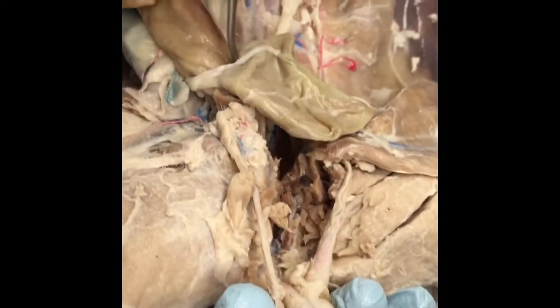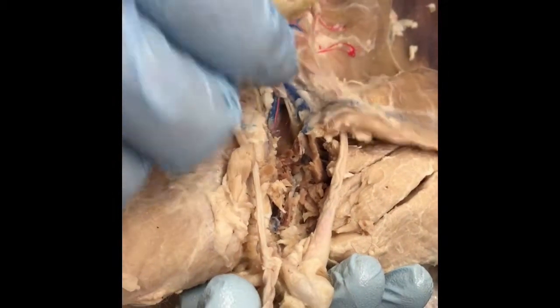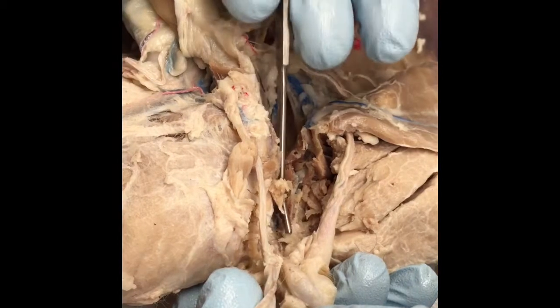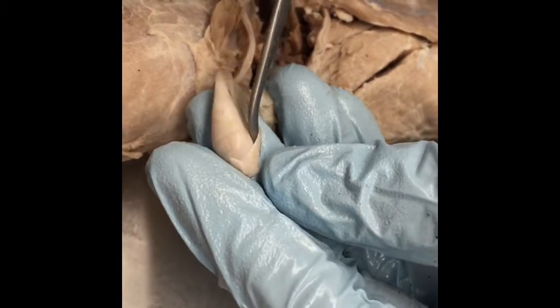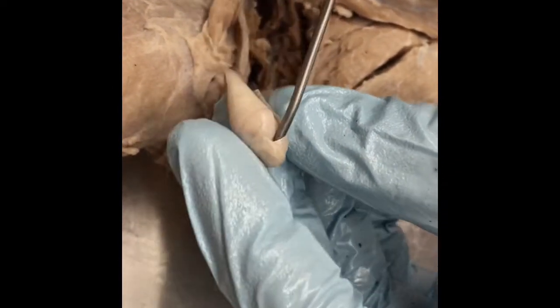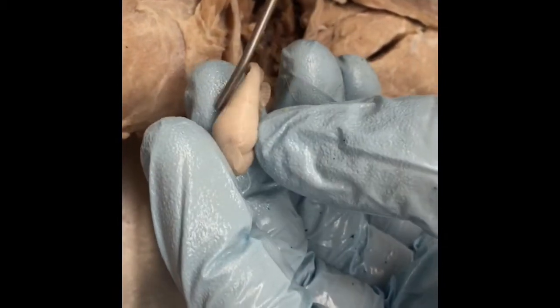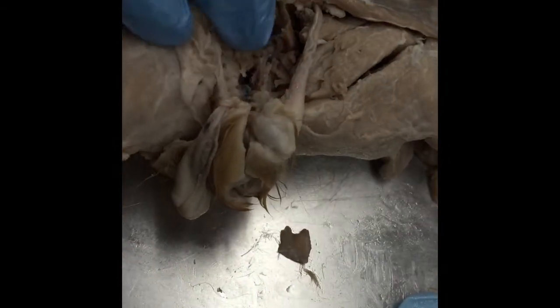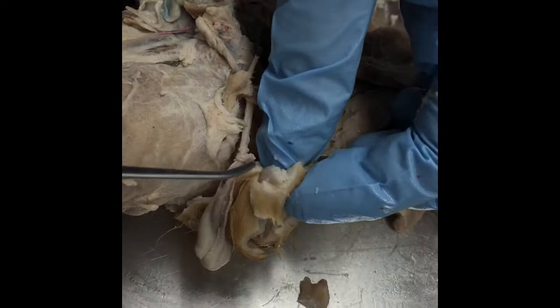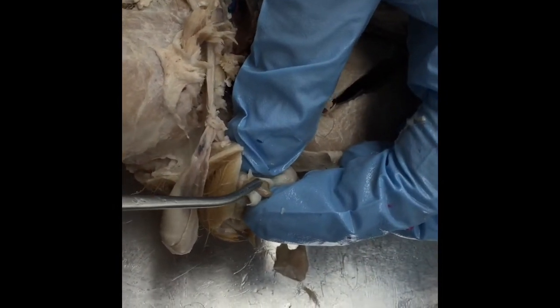So it goes all the way and it goes into the pelvic cavity and it goes to the penis. Oh, is that the loop? Yeah, that's a loop, and it goes to here. You can see the clear separation of the vas deferens. So this side is the epididymis, and the major body part is the testicle. Okay, and then this is the penis right here, and that's the glans penis.